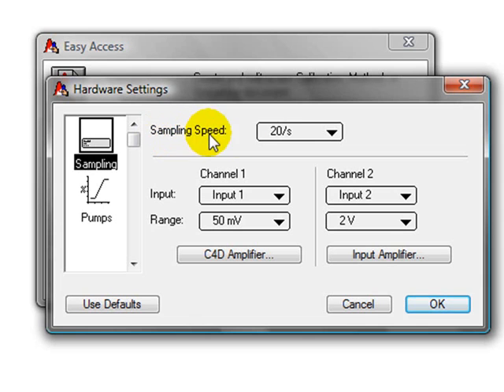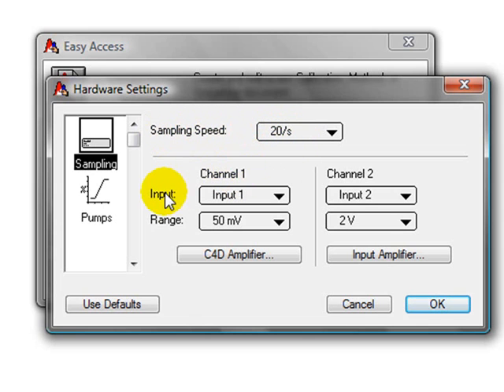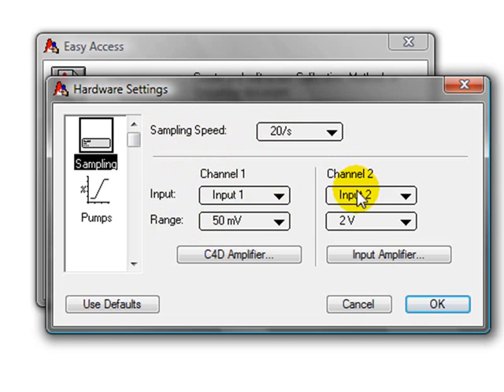The sampling speed should be 20 data points per second. For Channel 1, the input should be Input 1, the range 50mV. And for Channel 2, the input should be Input 2, and the range 2V.